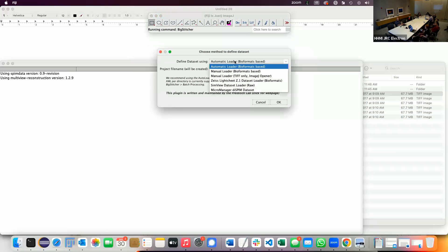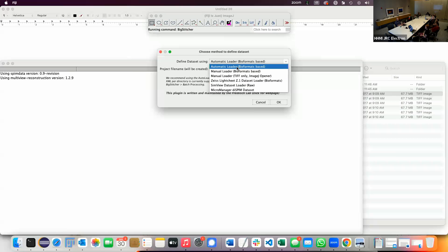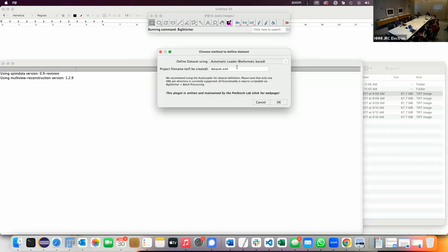There are several ways to define a dataset. Usually the first one — the automatic loader — is right. Unless you run into any issues, don't use anything else. The automatic loader is not a good idea if you import 5,000 files, because it uses BioFormats and looks at every file to extract the metadata — it will take literally hours. The other loaders will look at one file and assume the rest is the same. But usually the automatic loader is fine — we don't typically have 5,000 files.